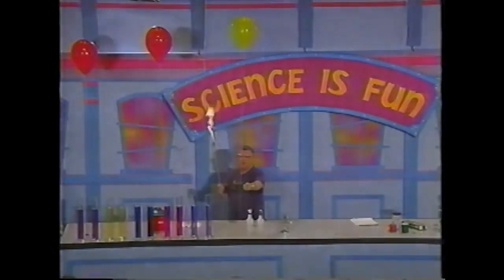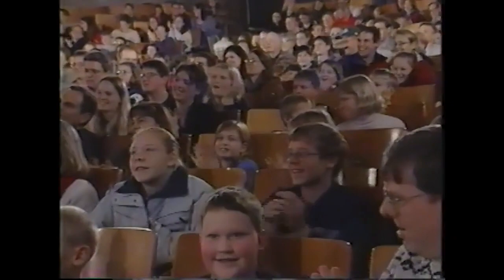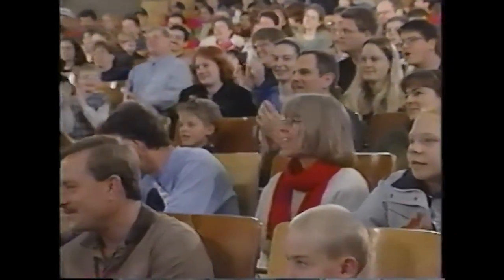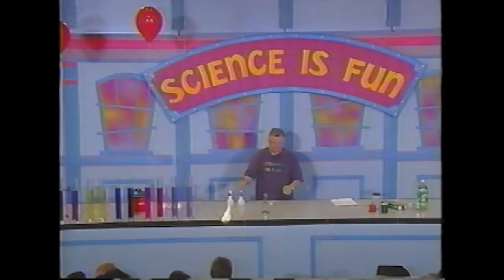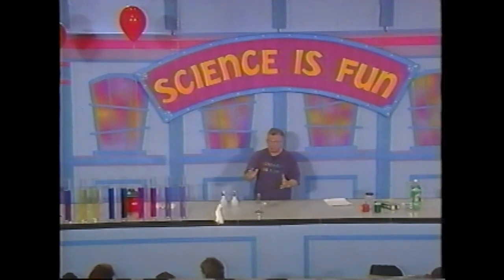Now, what do we always do in science? We repeat the experiment. So we're going to repeat the experiment, and we're going to do it in the dark. So with the lights down, please. I'll bring the flame to the balloon, and did you see the ball of fire?